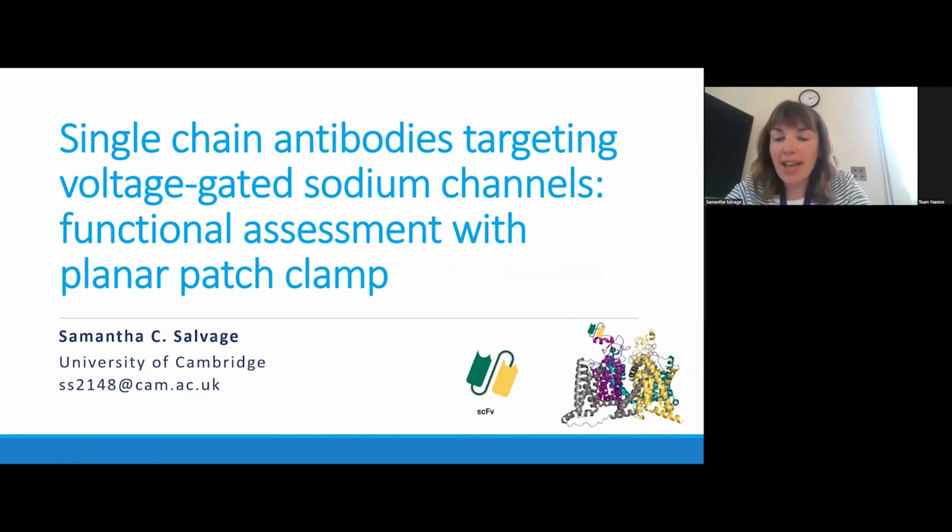I'd like to start by saying thank you to Ali and Shaymar and the team at Nanion for the opportunity to talk about our work here today. I'll be focusing on a recent endeavour in our lab where we're using single-chain antibodies to target voltage-gated sodium channels and then hopefully observe functional effects of these single-chain antibodies via planar patch clamp.